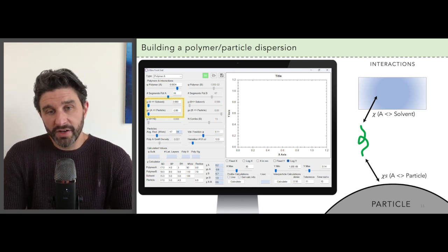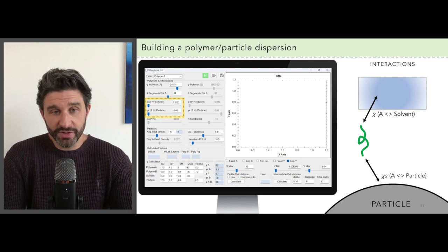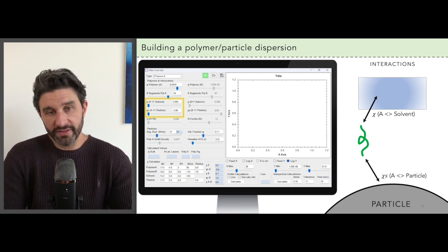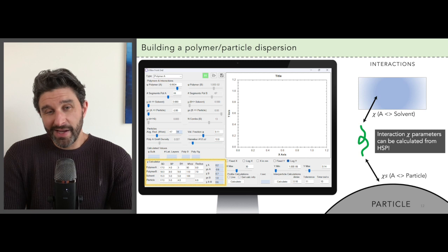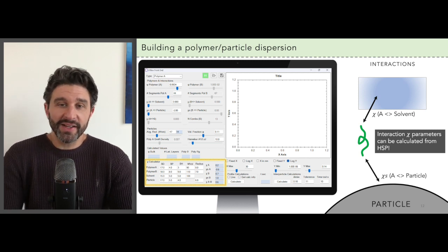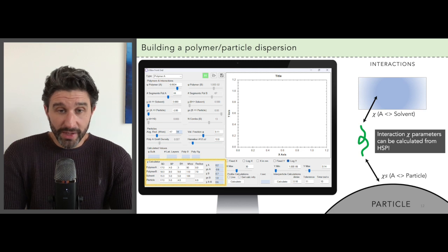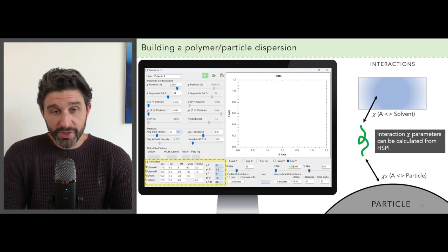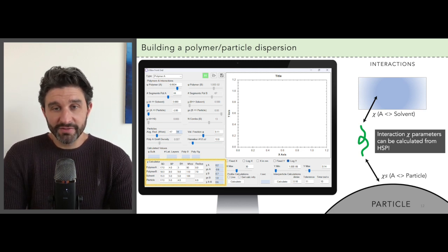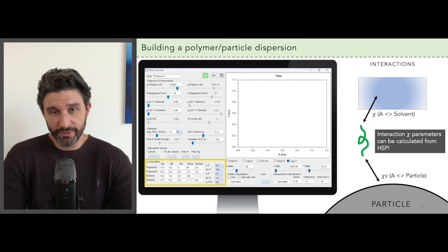But of course if you choose a different kind of architecture, then it enables these other controls that you can see over on the right hand side of this section. Now actually it's not always trivial to get the chi parameters from experiment. So more often you obtain the HSP parameters and then you can actually put these HSP parameters into the chi converter shown at the lower left of this window.